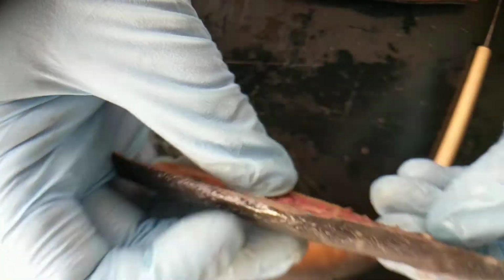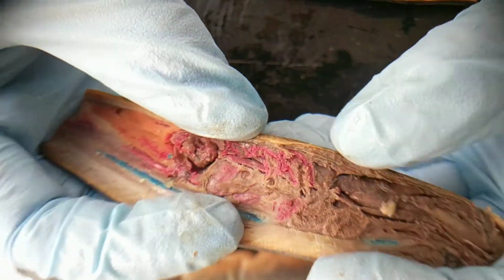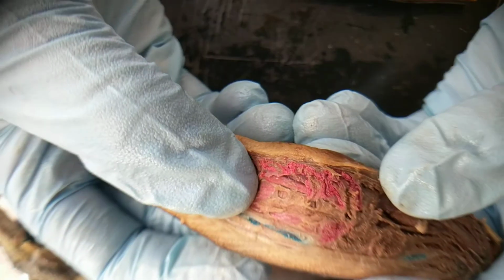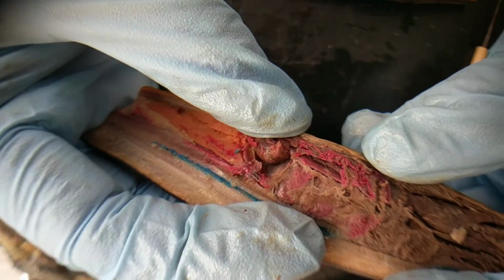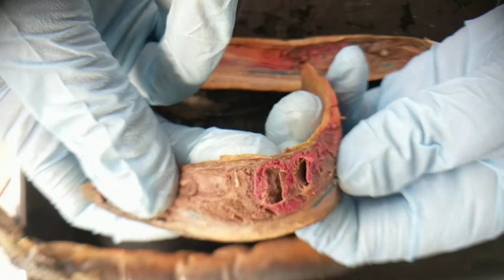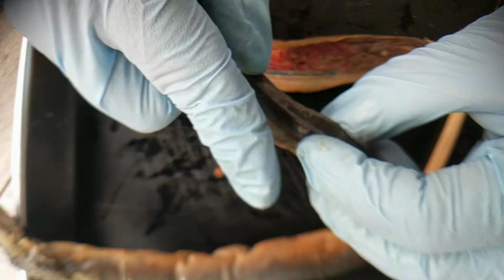But they all have gill slits, right? We saw that on the outside, you can see those gill openings, the little openings I showed you. And on the inside, this is the branchial basket and the gill slits. You can see where the circulation's going through, because that's the gills, where they're getting oxygen. So there's a lot of blood vessels bringing them in. Okay, and here on this side, I can open it a little bit better here. So that's the gill slits, right? Bring in water through the mouth, and then it passes across the gills and is expelled out the gill slits.